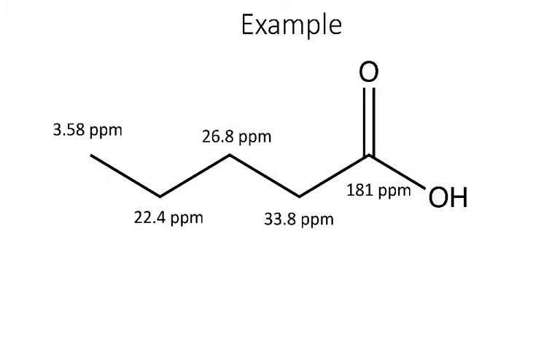Generally, the data you're going to be given doesn't have the carbon-13 NMR spectra, or at least what you're going to be getting in lab. I think the ones in the book, you'll actually be getting the spectra. What you're going to get in lab is typically just going to be a list of the chemical shifts and then also what the splittings are. Now, one difference: the carbon-13 data that we're going to be getting in lab is what's called proton-coupled carbon-13 NMR, and so in that case we do get splittings. If you notice the discussion in the book, they don't have splittings in the carbon-13 NMR spectrum, so we're going to have a little bit of extra data than the spectra that you see in the book.